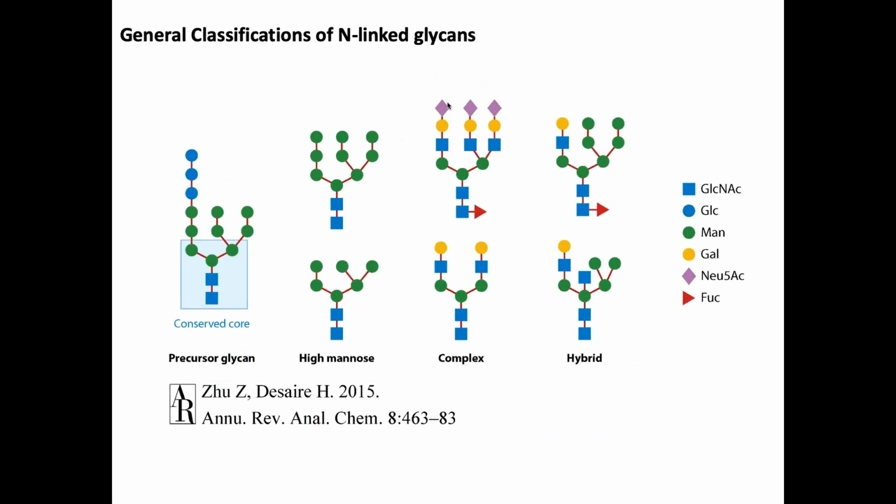And one of the biggest arguments that you would hear people have is that you don't use MALDI because it pops off the sialic acids. Big groups would get into all these kinds of arguments. Not having any direct experience with it, I can't say one way or another. But I've mentioned this before, and I'll mention it again: this is one of the reasons that perhaps MALDI is not as widely used for these types of things, because of the fear that, although it's soft, it's not as soft as electrospray, and the worry that you're going to miss some of these things.